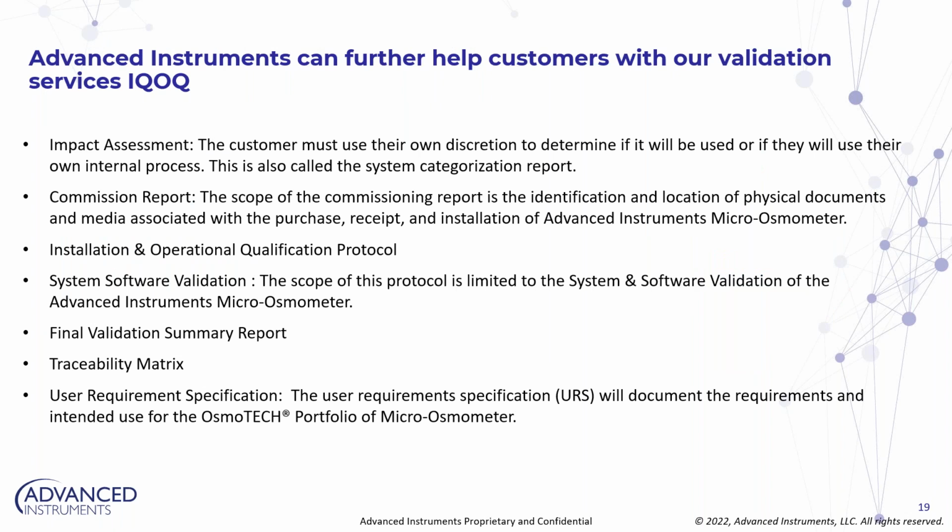Having said both of this, what's another critical aspect is with advanced instruments, we also help do the validation. So if you're in a GMP environment and you're bringing the instrument in-house, you're also going to have to qualify the devices, right? Perform an installation qualification, operational qualification, and especially when you bring a device into a GMP facility, a GMP environment, and it has all of these data integrity capabilities built in, you need to be able to make sure that it's been tested and validated.